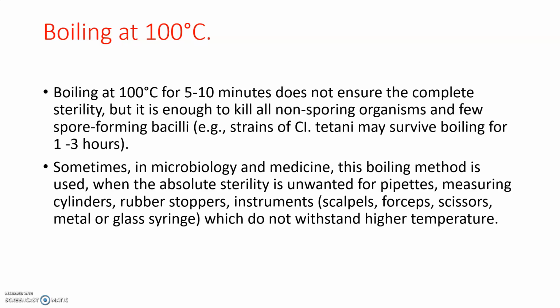This boiling method, in medicine as well as in microbiology, is used when absolute sterility is unwanted. It can be recommended in certain procedures, for pipettes, for example, measuring cylinders, rubber stoppers, instruments such as scalpels, forceps, scissors, and metal or glass syringes.